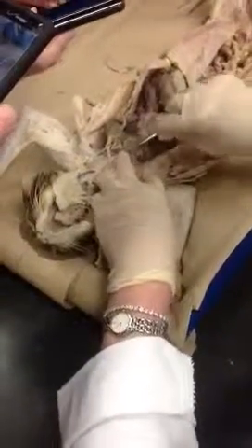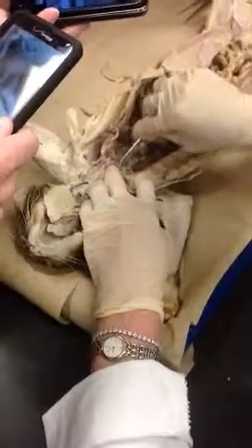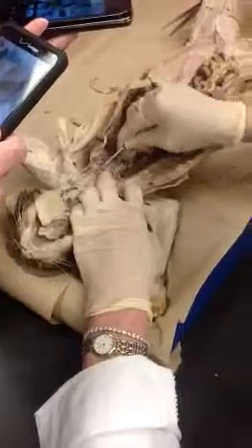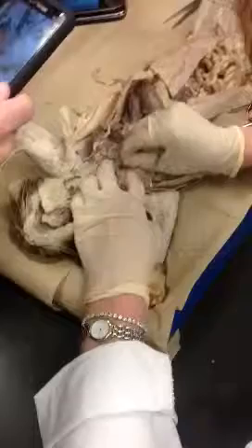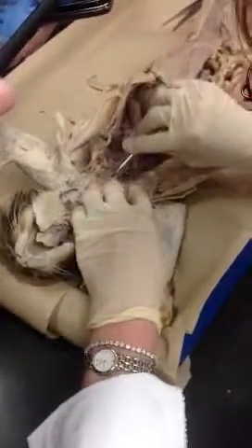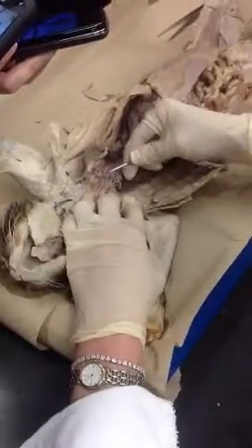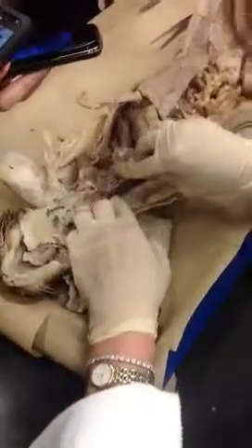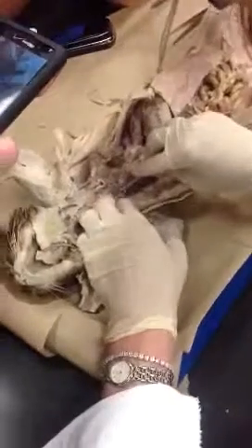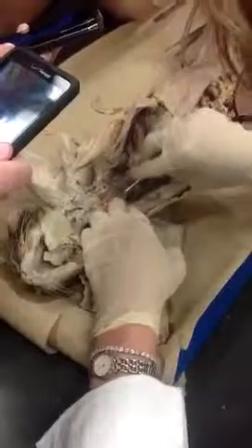I popped that on this side because we're going to do this side anyway on the veins. All right, so here we go again. There's your right common carotid, right here. This is your right subclavian, and you can see this one going down. That is the internal mammary. Directly across from that, you have 3 little bitty vessels. These are the only ones that are itty bitty, teeny tiny, and I realize that. So I want to dissect them out nicely so that you can see them.